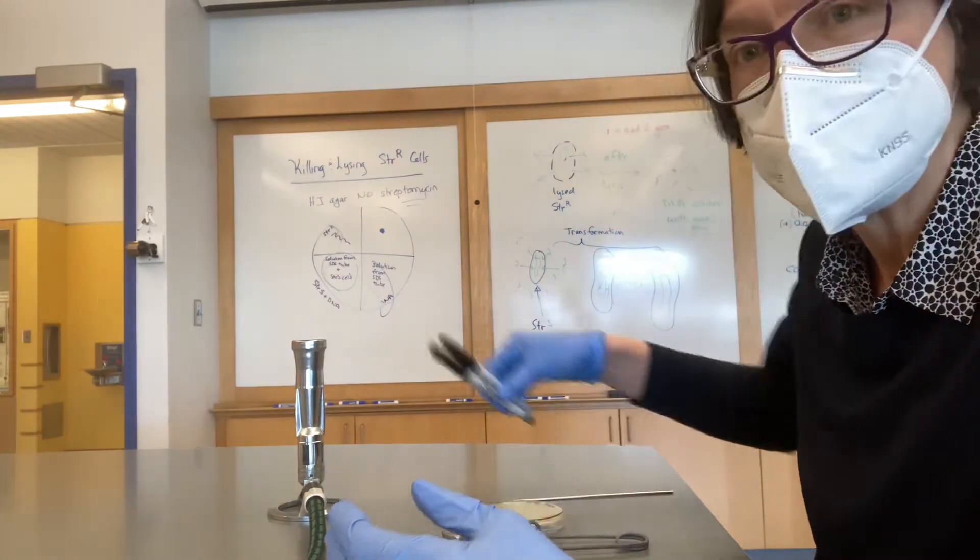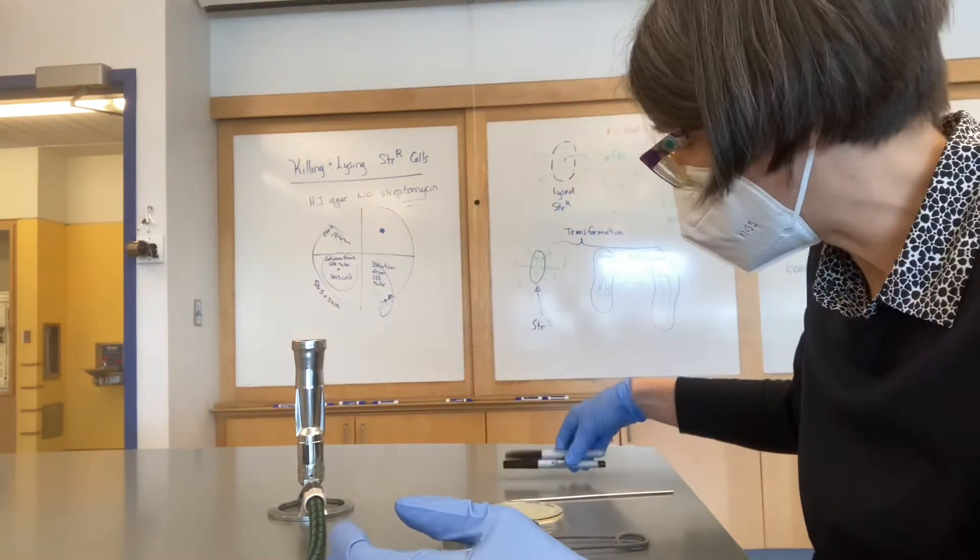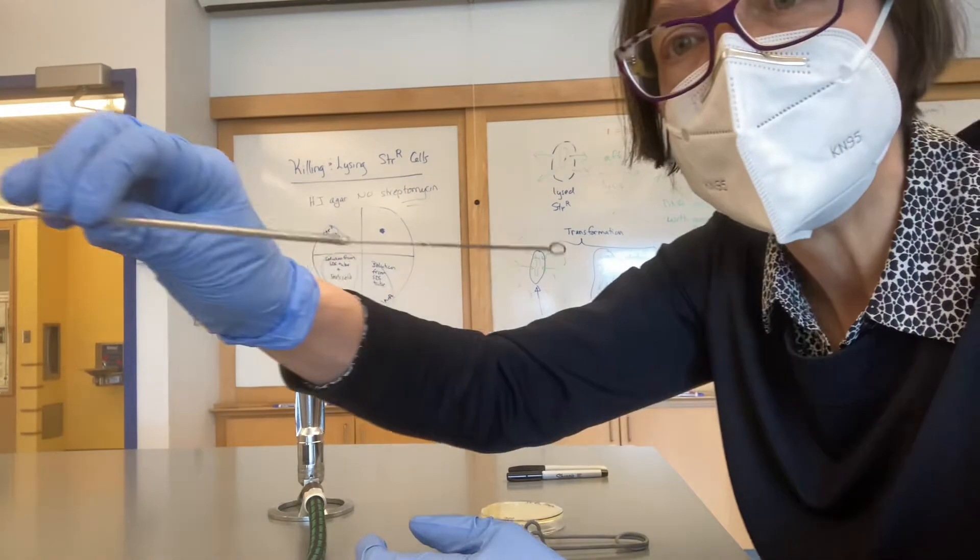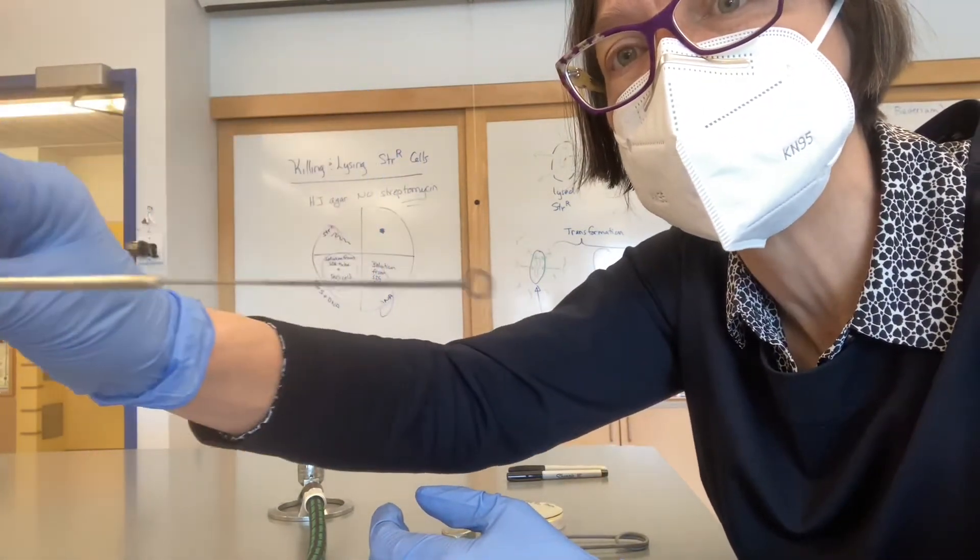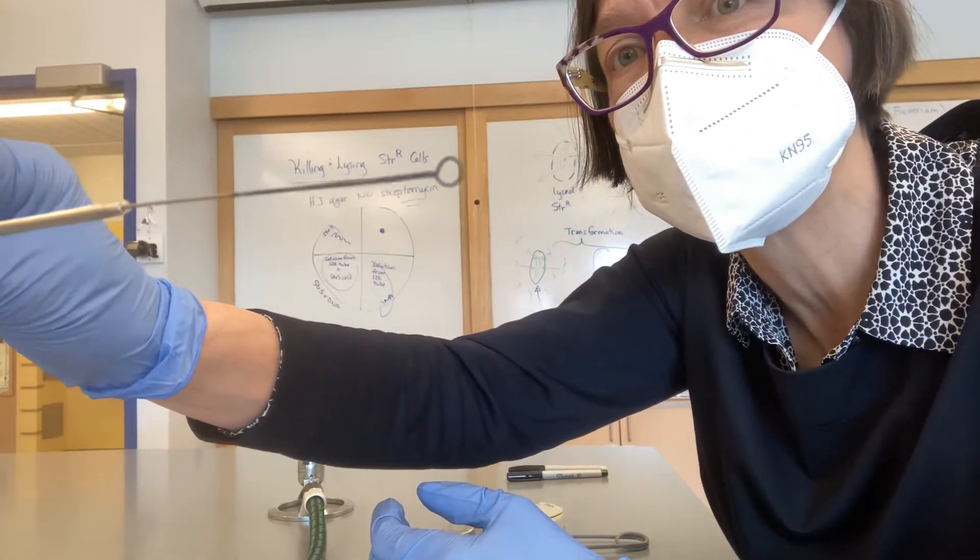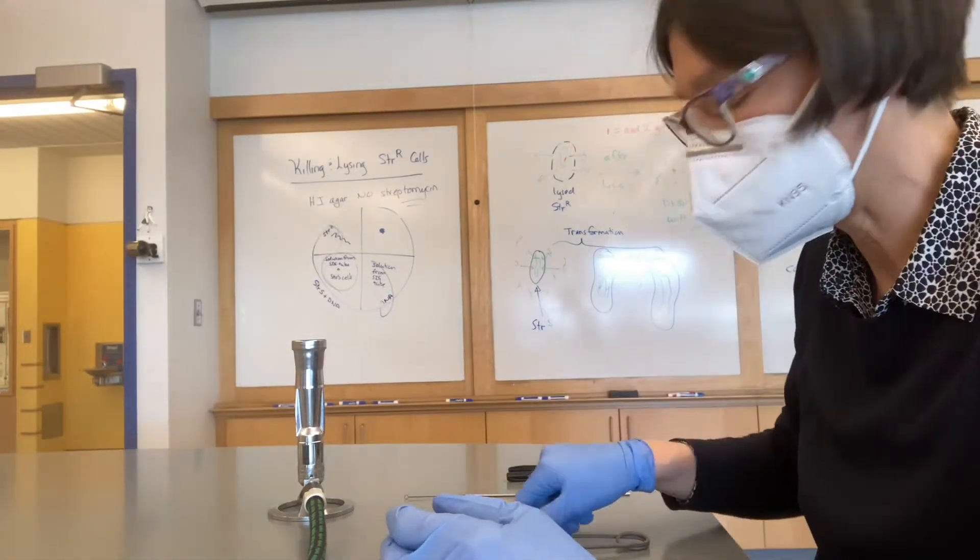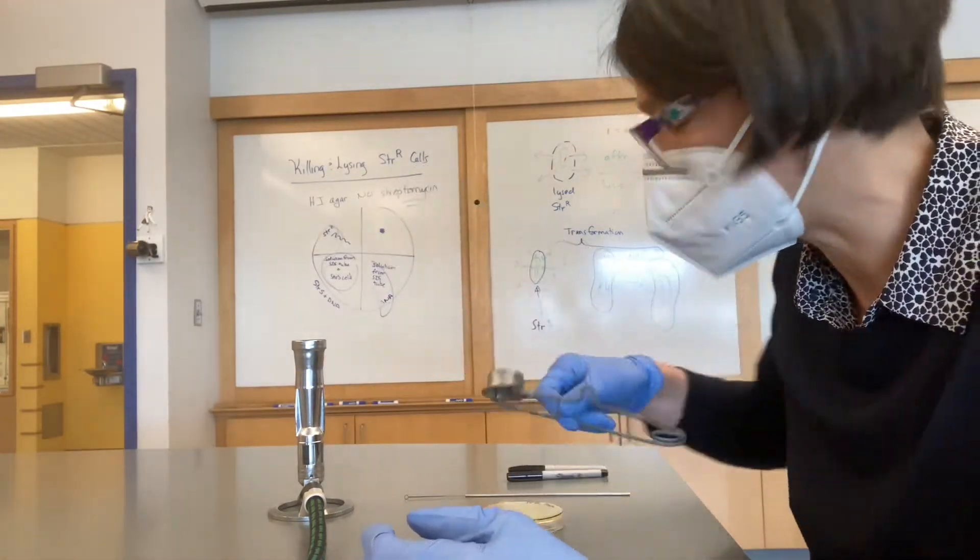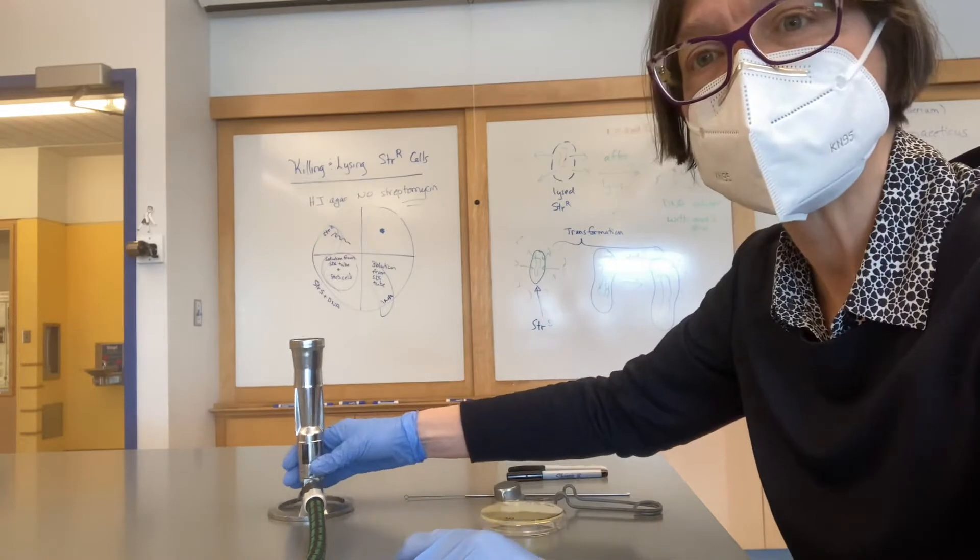We have Sharpie markers for labeling. We have an inoculating loop. Notice the circle on the end. And we have a striker to light the Bunsen burner, and a Bunsen burner.